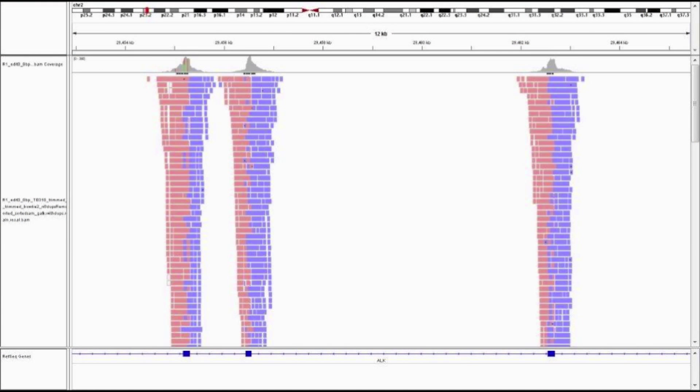After GATK, you'll get a new processed BAM file after realignment and recalibration. This BAM file can then be used in IGV to visualize the SNPs.